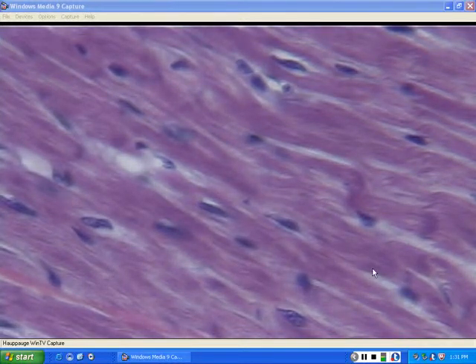So as we move on to our next one, the smooth muscle, we'll see that it in and of itself is also an involuntary muscle. And these two are very deeply contrasted to our original skeletal muscle, which again was voluntary.